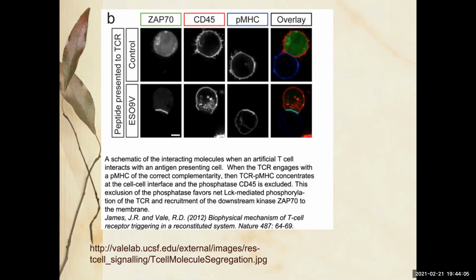So again, this was green, and this is what they saw in the green channel. This is what they saw in the red channel. It was green in real life, but they captured it as black and white and then added the green color back here. It's kind of teal because it overlaps with the other colors a little bit. So it's actually overlapping with the blue too. That's why you see it as a nice teal color.